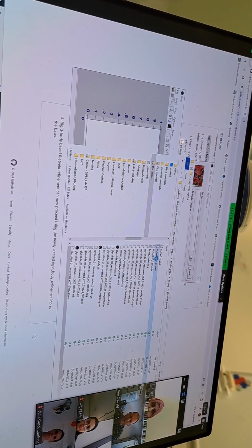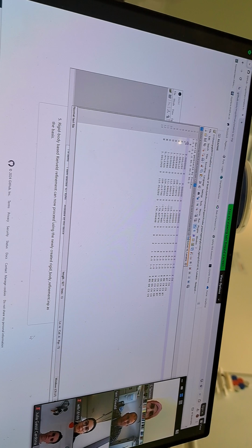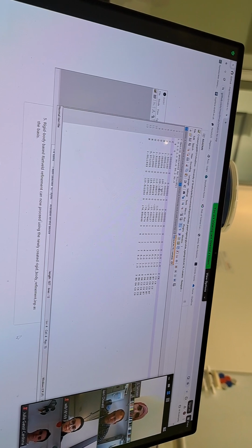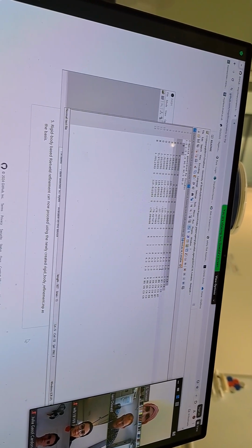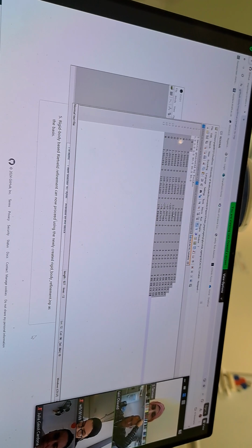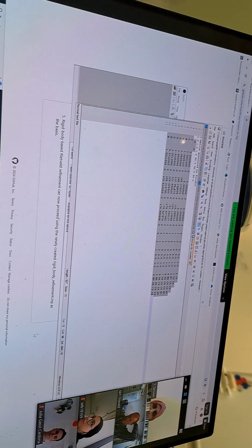Now, if we open this up, as a reminder, we've got this setup. We've got our carbon, and then three columns. That's going to be our bond lengths, bond angles, and torsional angles. This is the way that it's set up in DASH. It's not the way I like to look at it, and I much prefer the Topas one, so we'll get onto that in a minute. But you can see there that there are distances between various atoms and so forth, and angles.